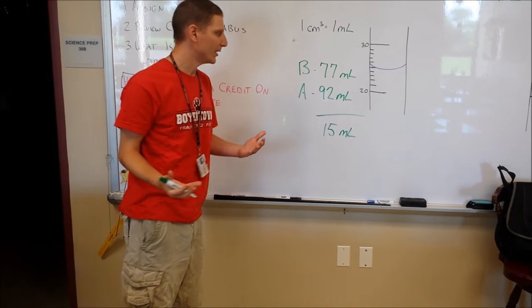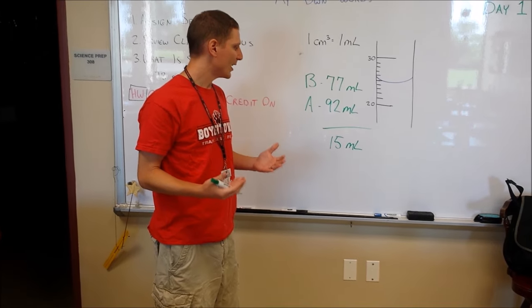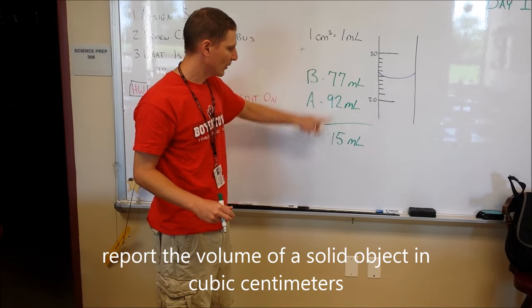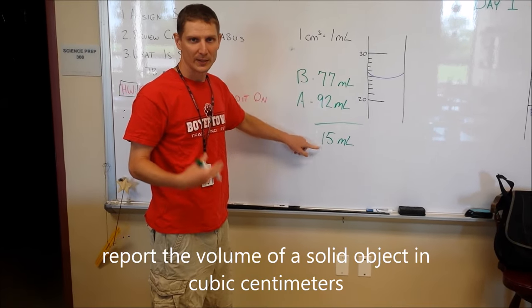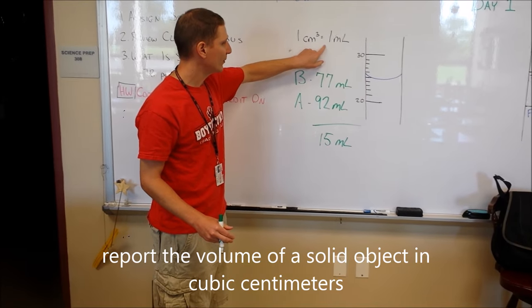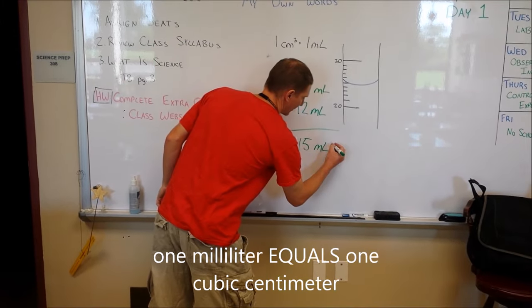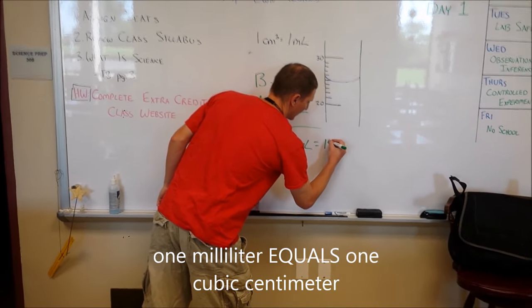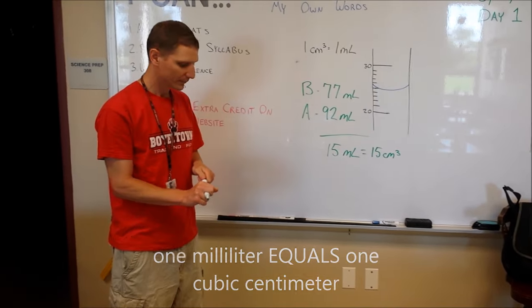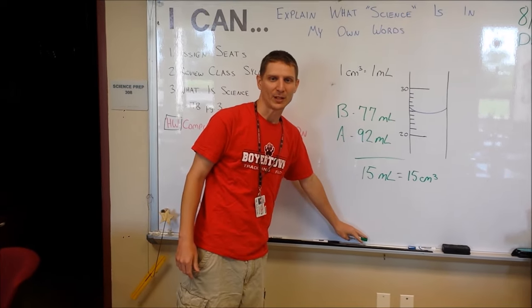Now the last little hiccup we have is that we were measuring a solid object. And solid objects are always measured in centimeters cubed. Our volume's in milliliters. We need to convert this. So we have this conversion, 1 centimeter cubed is equal to 1 milliliter. So the actual volume of this object is 15 centimeters cubed. And that's finding the volume of an irregularly shaped object.